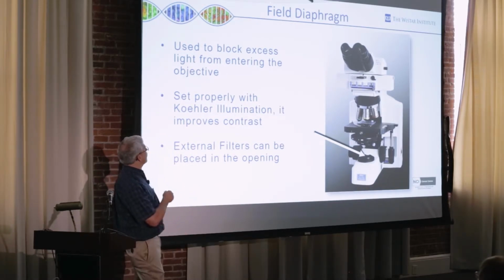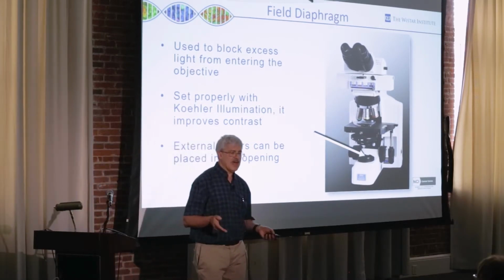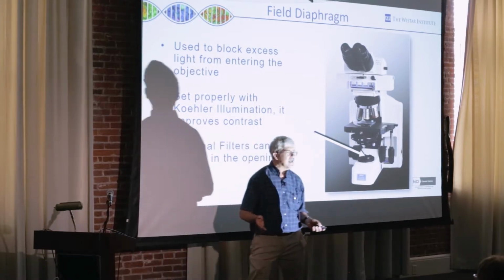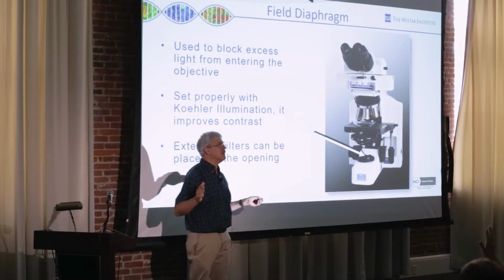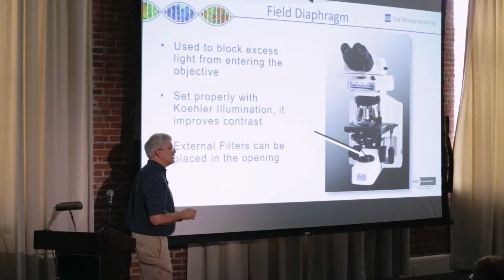Oh, there's that word. I know that the number of hands that are going to be raised here are going to be higher than most times I ask this question, but true show of hands, how many people have ever heard the word Kohler illumination before? How many of you? Oh, good, a whole lot of you, but there are still a few who haven't, so we're going to go through the process.